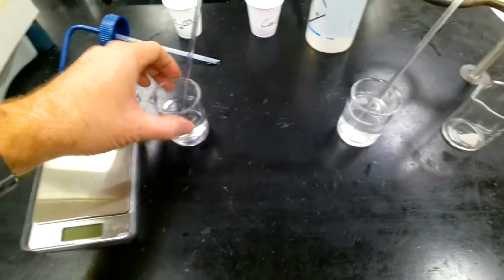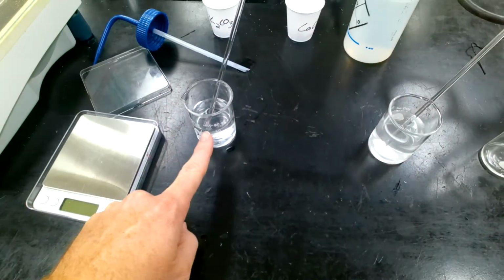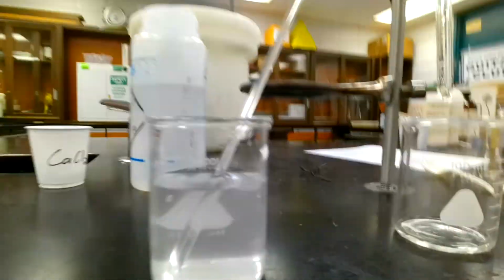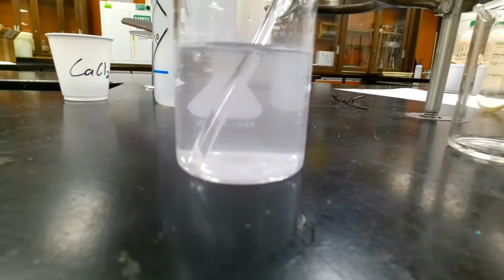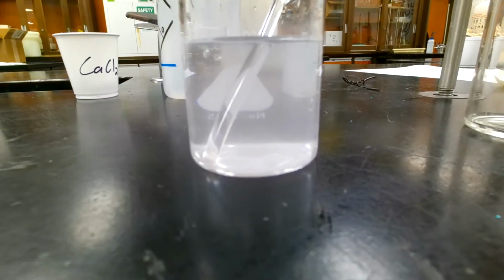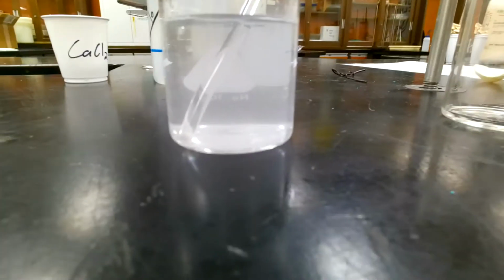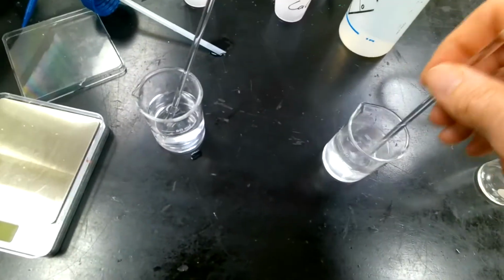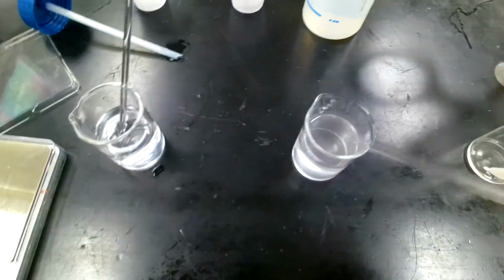Okay, we're back, and on the left we have the potassium carbonate, K2CO3, and on the right we have the calcium chloride. You can see the calcium chloride is still a little cloudy, and it should dissolve all the way. If I heated it up and really made an effort to dissolve it, or gave it more time and more stirring, it would probably dissolve, and that's what I probably should do, but I'm going to move on. That would be best lab practice.